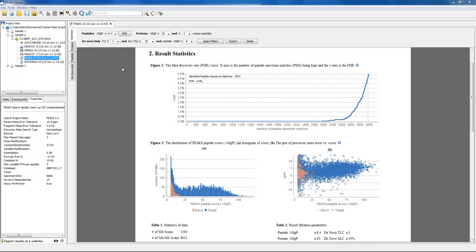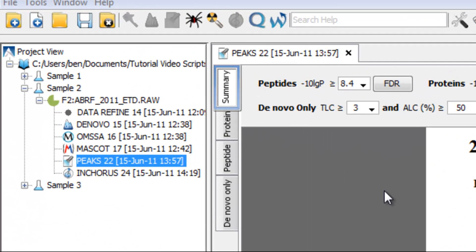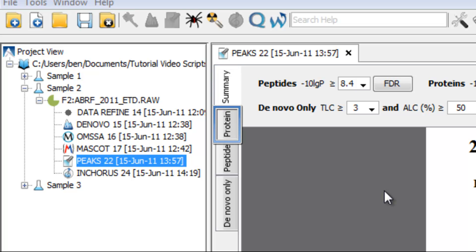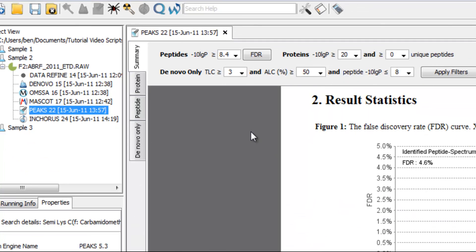The workflow consists of a summary of the results, the identified proteins, the identified peptides, and a list of peptides identified exclusively by de novo sequencing.